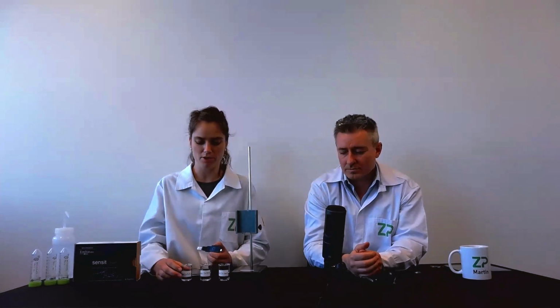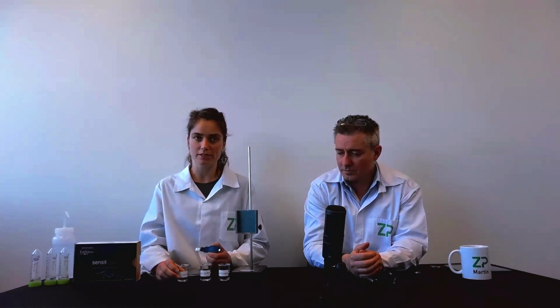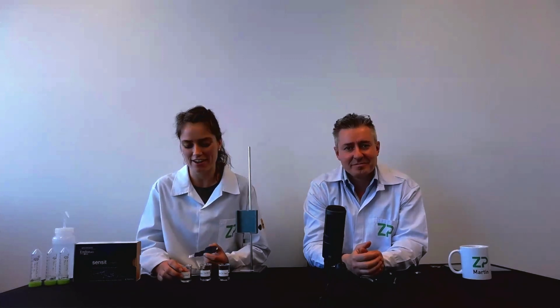Okay, so my name is Solren, and I will demonstrate how we are measuring using an impedance spectrometer for a sodium chloride solution with different concentrations. So this is the really neat small PalmSens Sensit Smart that we've been talking about, and it's connected with an adapter to one of the sensors from Zimmer and Peacock. So we will insert that into a smartphone.